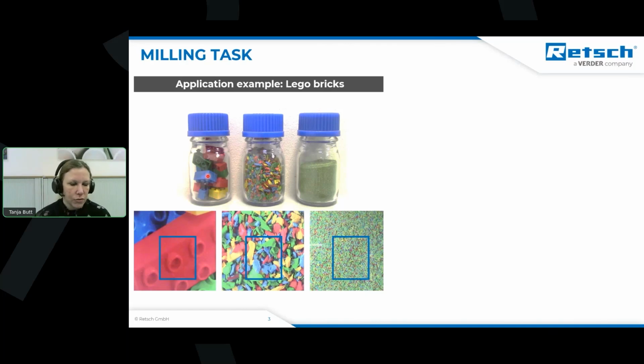And in one of the different colors, maybe there are toxic substances. So if you can pick only one and you pick the wrong one, maybe only the red, you won't see the substances and you will claim it's not toxic. So you have to homogenize it in order to get a little bit of the blue, of the yellow, and of the other colors in the few milligrams of sample you can analyze.